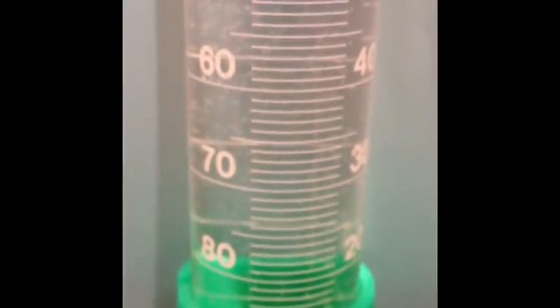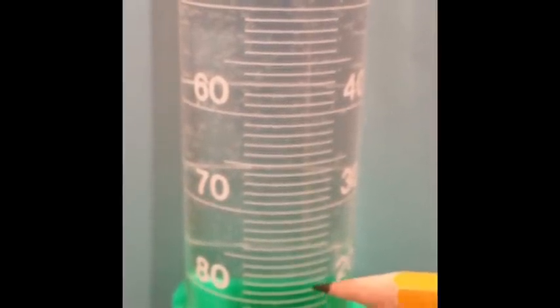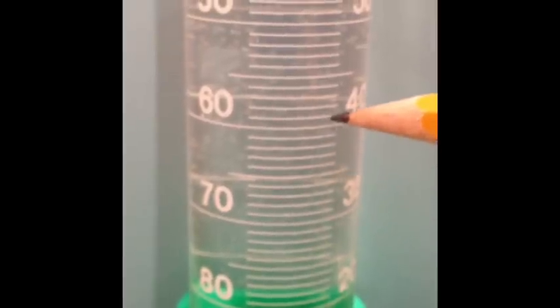It's not really very confusing. You just need to think in my class we're putting water in the graduated cylinder and filling it up. So the water goes in and we then have 20, we then have 30, 40, and then 50, and then if we would have 60. We're not quite at 60, so we can begin to figure out exactly how much water there is.